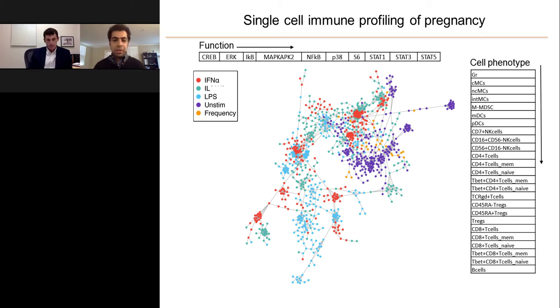All right, thanks, Brice. We can talk a little bit about how we can take this data set and build those models that predict gestational age. The first thing that we observed in this graph was that the data is actually very modular. This is consistent with what we already know about the immune system, that multiple signaling pathways from multiple cell types correlate closely with each other. And you can see them in the form of these tight correlation modules in this graph. So when building a model that would make predictions, we would have to take that into account.